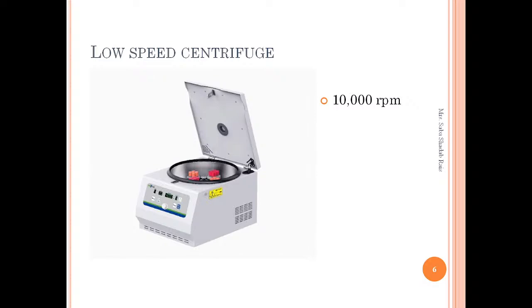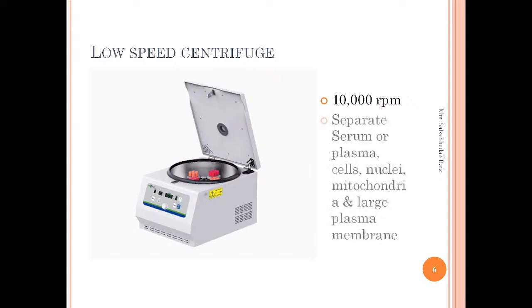I'm very sorry, students. So let's talk about its application. The application of the clinical centrifuge machine is that we can use it for the separation of biological samples, like serum or plasma, which we want to separate from red blood cells, and to harvest purified chemical precipitates.